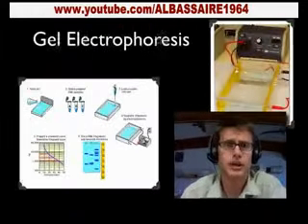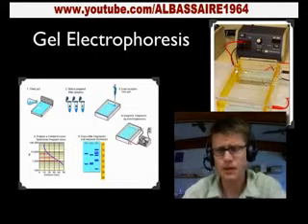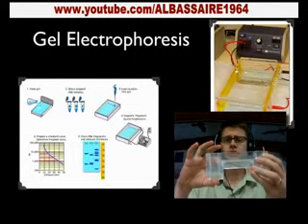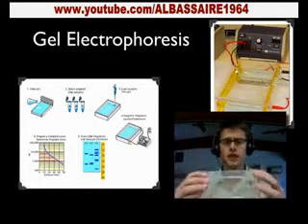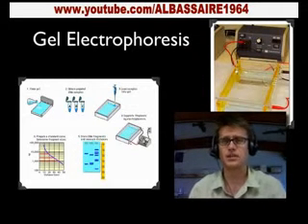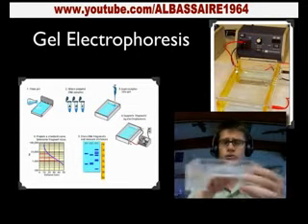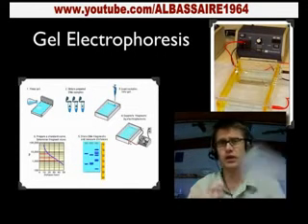Let's look at the other one then. The other one is called gel electrophoresis, and this is a gel box. I've got one right here. So a gel box looks something like this. It's filled up with a buffer solution, and then your gel just kind of floats on that surface right there. The gel that we use is an agarose gel, and the way to think about that is it's got macromolecules in it. It's got these bonds between them, and so the DNA, as it moves from one side to the other, is going to separate according to its fragment length.